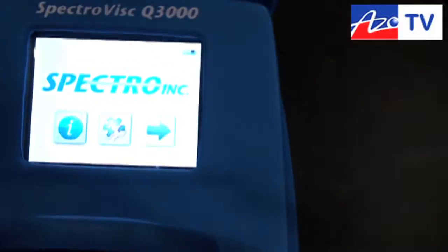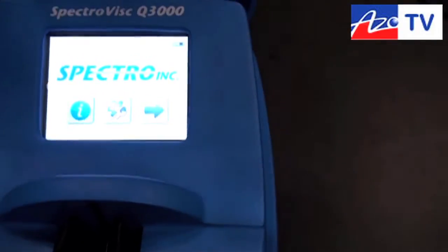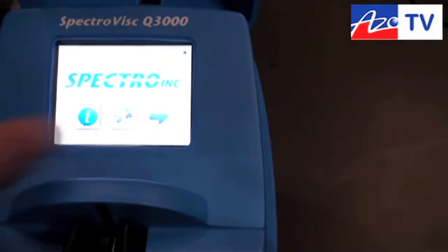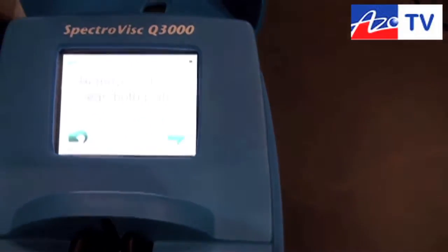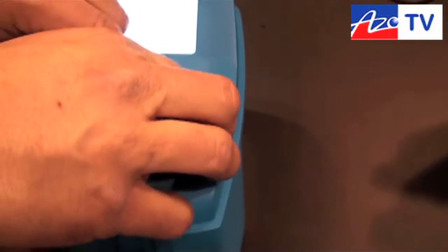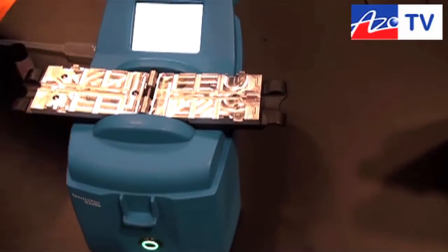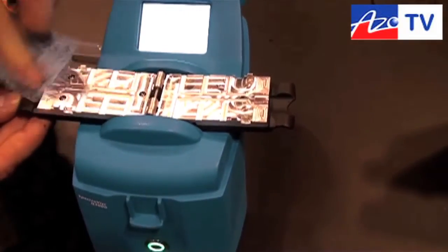The first thing we're going to do is show you how we set it up. The nice thing is that the system walks us through the sampling process so there's little to no training required. It says: remove the cell, clean both plates. So what we do is lift the sampling cartridge cell, open it out — it's a split cell — and simply wipe it clean to make sure it's good. Then it says: insert the clean cell into the system.